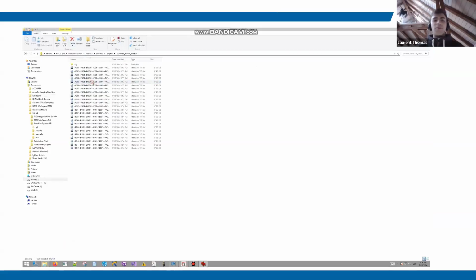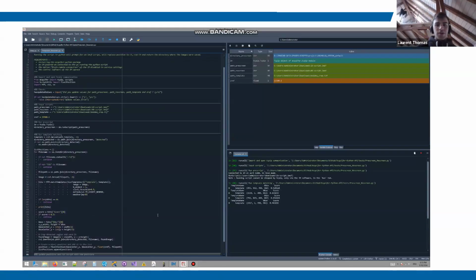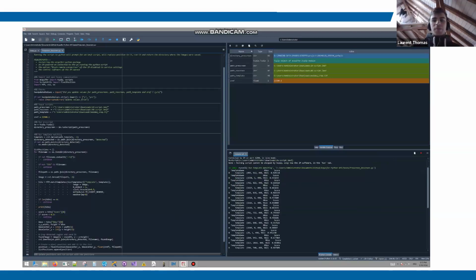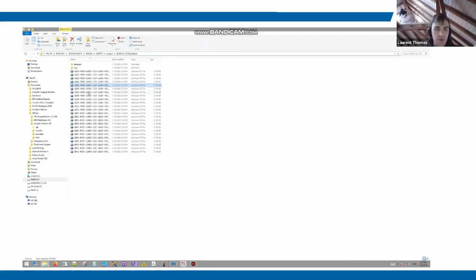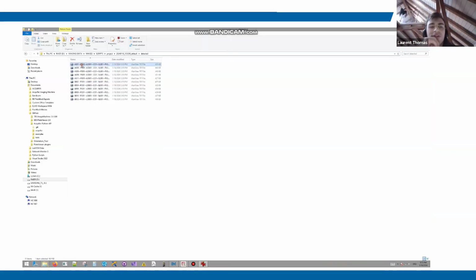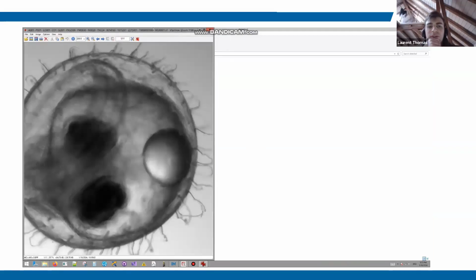So on this system, we get basically a single TIFF file for each plane that was acquired. Okay, and then for each of these images, I'm going to run the detection. So we have a for loop running the template matching on each well. It's a bit small, but I will share the file afterwards. So this is the result of the detection. We get basically a bounding box and a score for each of them, and also save the detected region just for controlling.